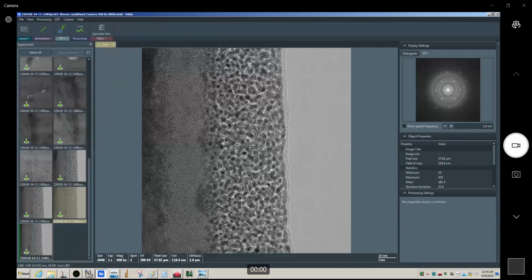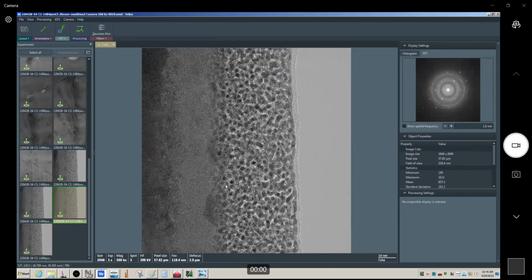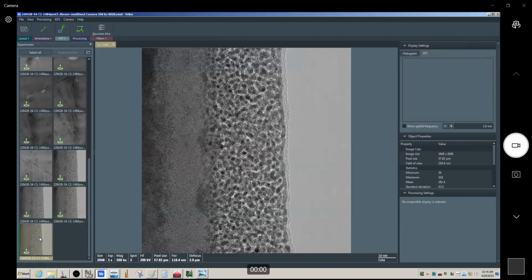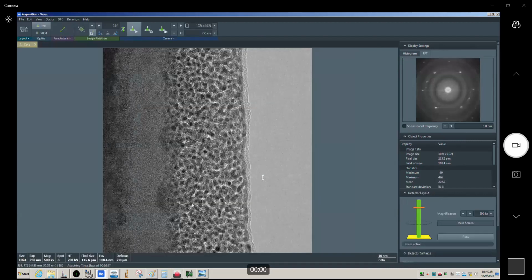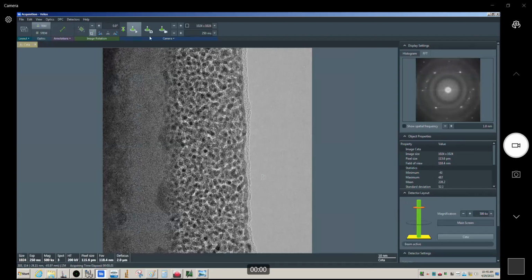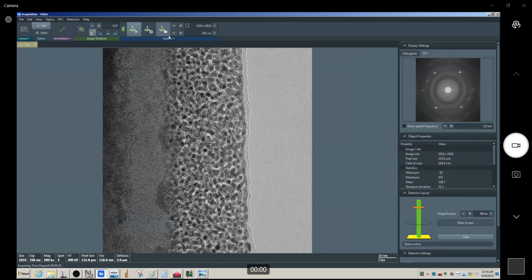this was the frame combined image, and this is the non-frame combined image. You can see they look very good. They look basically the same. It does say 1 second for the exposure time here, just like it does here. But what's more useful here is to do frame combining with drift correction.